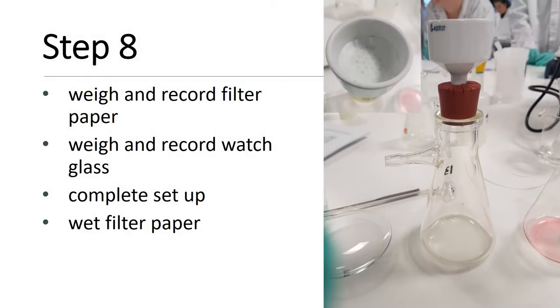Step 8. While the solution is crystallising, weigh and record the weight of the filter paper and the watch glass separately. Then set up the Buchner funnel and filter paper with the sidearm filter flask. Remember to wet the filter paper first.